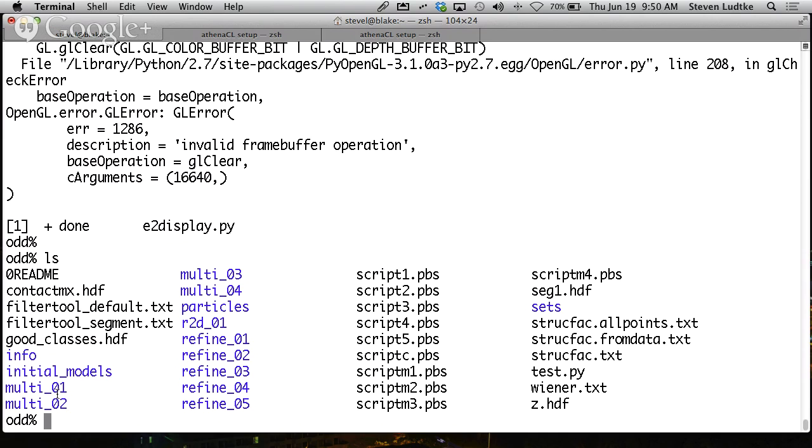So first I would start by running a normal refinement. I would get my structure out, and I would find where this extra ligand is. Then I would manually exclude the ligand, in this case the channel, from one of the volumes. So then I would have 2 reference volumes. I would have one reference volume that has the channel, although it's kind of weak because it wasn't present in all the particles, and then I'd have another volume where I manually wiped out the channel. Then I could run a multi-model refinement where I use 2 different references, one with the channel, one without the channel, and then the particles would hopefully segregate into 2 groups, one set of particles with channels and one set of particles without channels.